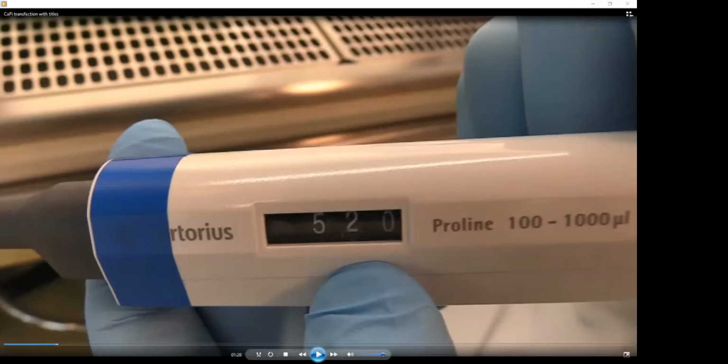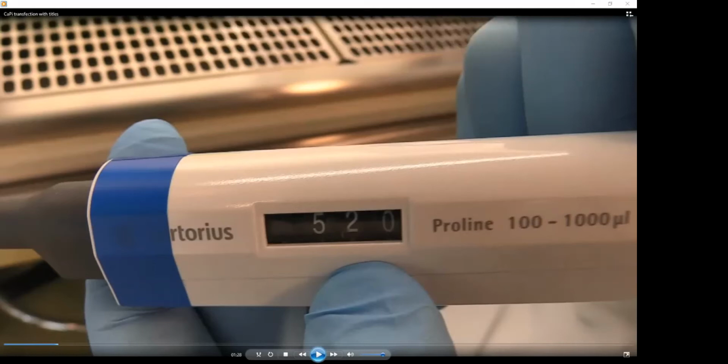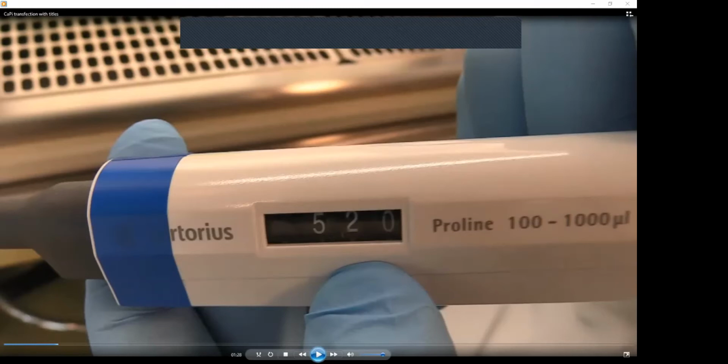In the case of the HEPES buffered saline, it's 13 times 40 microliters, which is 520 microliters. And this solution we call solution A. It is also important to notice this because in one step we will mix together DNA with calcium chloride and this HEPES buffered saline, and there it's necessary to know that we have labeled this HEPES buffered saline as tube A.